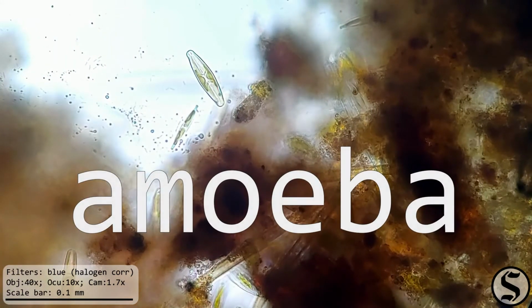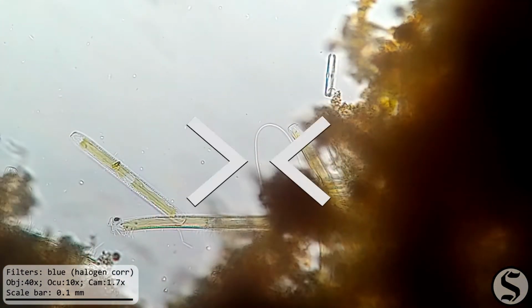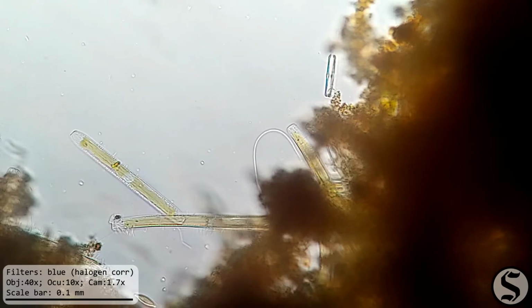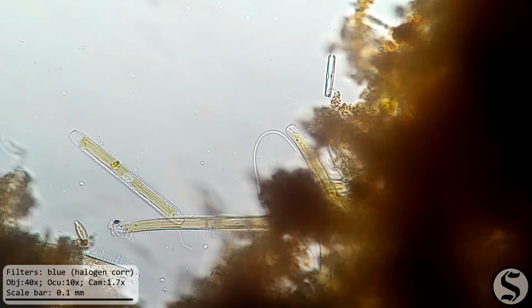Oh, check that out. We've got an amoeba. That comes from the Greek amoebe, for change. Well, I thought this sample was oops all diatoms, but we've got another thing in there. And that interesting filament there is bacteria. That comes from the Greek bakteria, which means a rod or a stick. And that's related to the Latin bacillus that we discussed before.